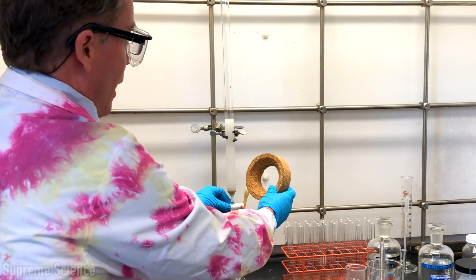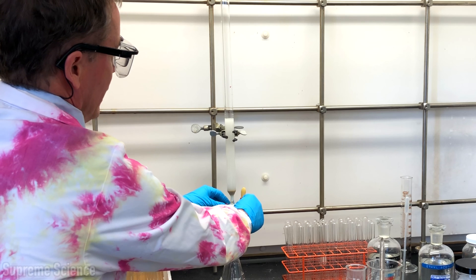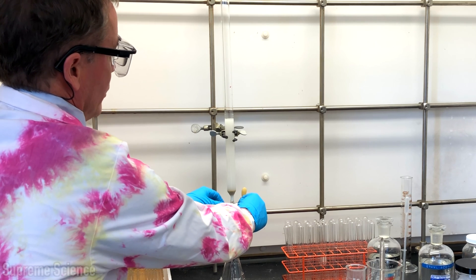And make sure you don't tap the column with anything metal. When the solvent gets to the top of the silica gel I'm going to turn the stopcock off.